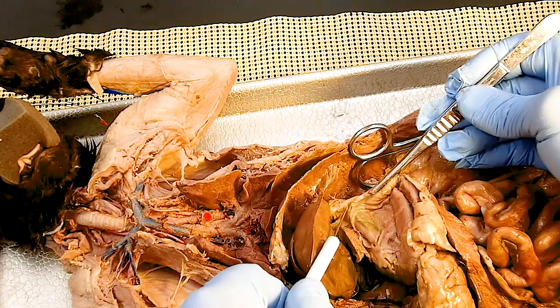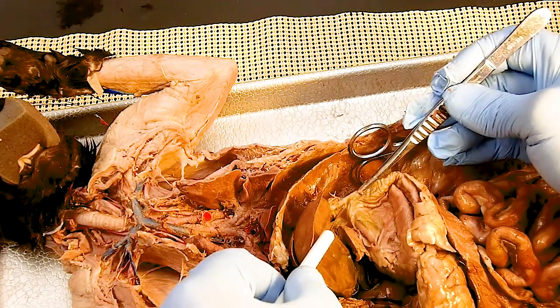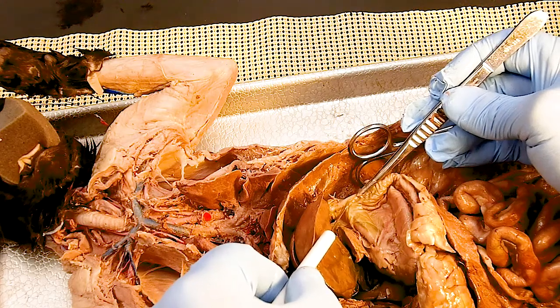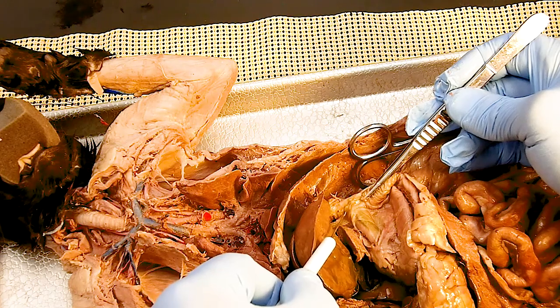It's a sphincter, an enlarged ring of circular smooth muscle. It prevents the food from exiting your stomach back out your esophagus, so you can stand on your head after you've eaten, and it doesn't pour out your mouth, which is kind of handy.